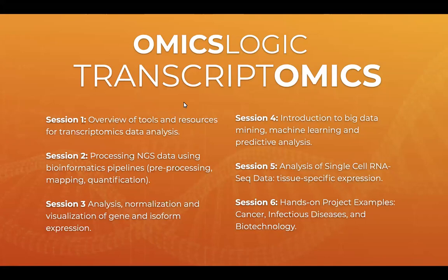Then we talked about the need for normalization of that expression level. And here we talked about genes and isoforms as two ways to look at our data and the need for having a data set that is distributed.